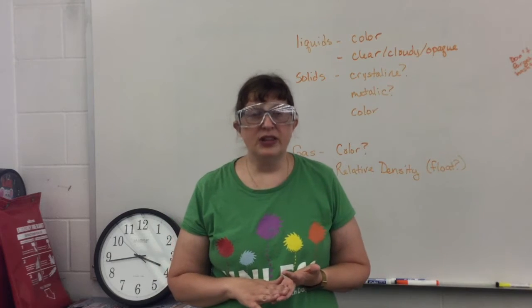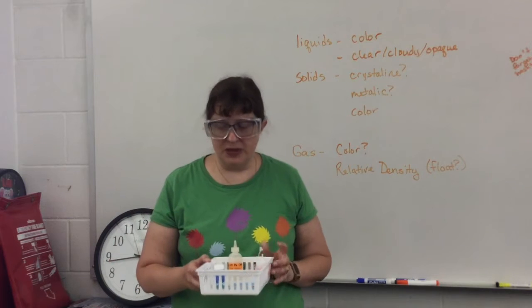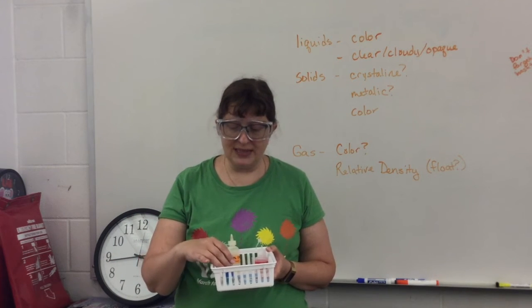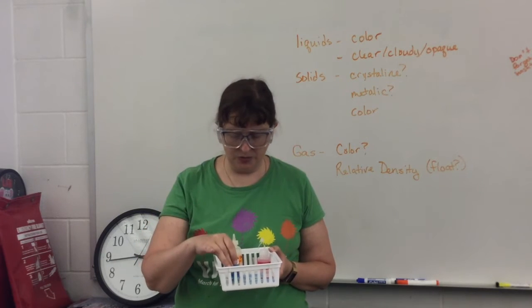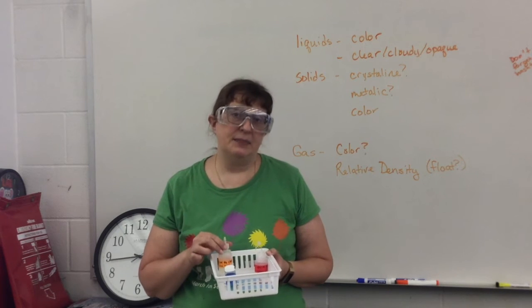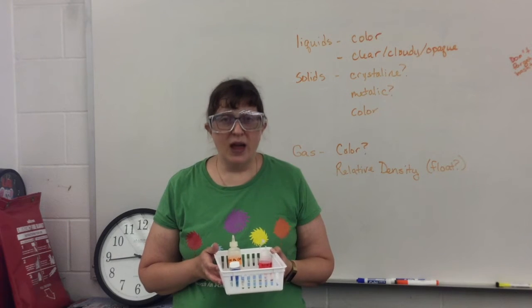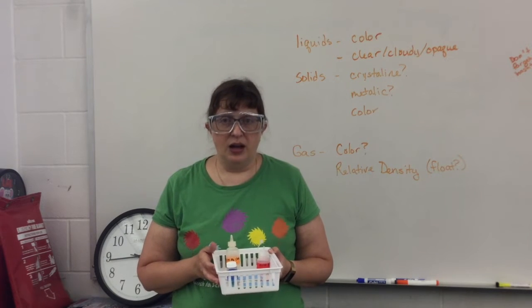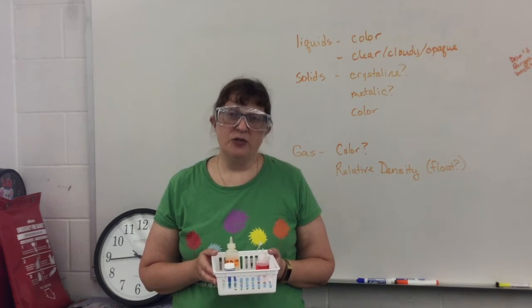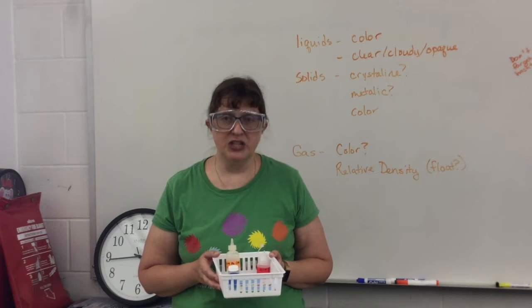The other basket at your lab bench will contain materials for 1 or 2 of the other experiments. This basket contains materials for experiment C, including copper chloride and aluminum, and for experiment F, including lead nitrate and potassium iodide. Your directions will tell you what you're supposed to do and when with these particular experiments. It is important that when it says set up the experiment now that you do that so that you're ready to go when it's your time to demonstrate your particular materials.